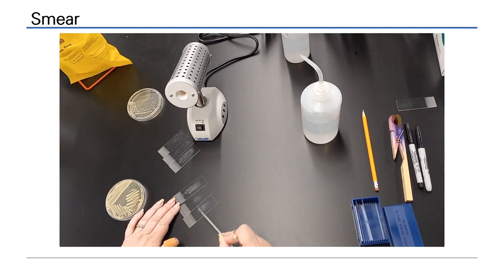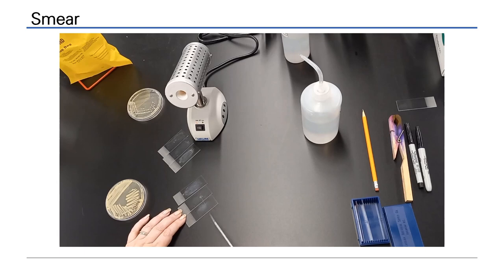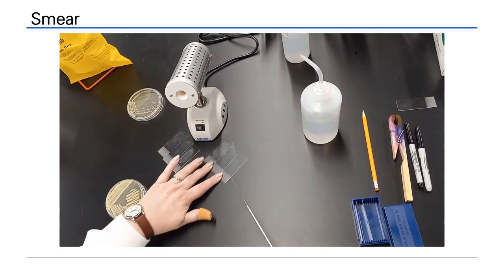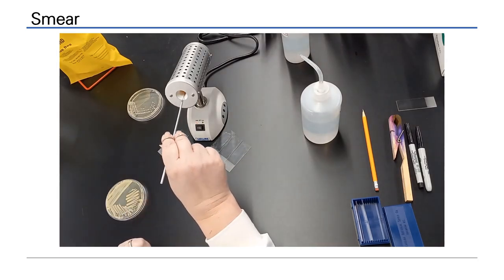Because this top drop was too small, it has already dried. It's too difficult to spread it across the whole surface. The cells clump and will not produce a monolayer. This one, although it will smear easily, the liquid is too high a volume. It will take far too long to air dry. The bottom one is just right. It smears easily and will dry relatively quickly.